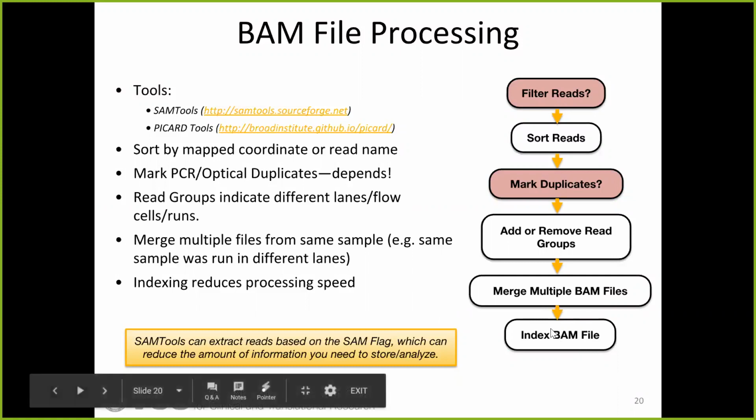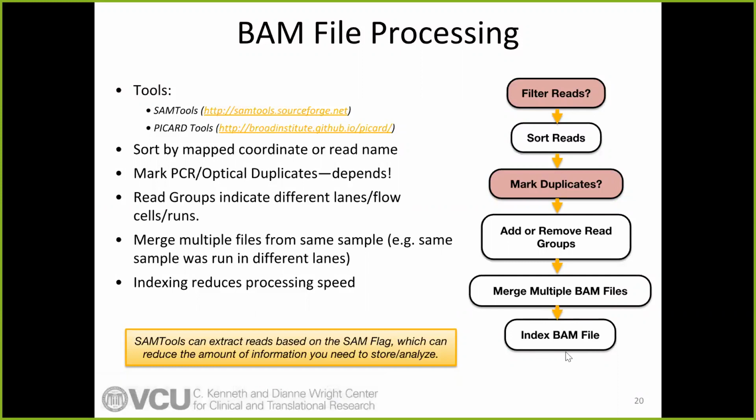And then finally, the last step is generally always, downstream tools always require you to index your BAM file. And this is kind of like just a roadmap, so these tools can navigate these files more efficiently because BAM files can be rather large.